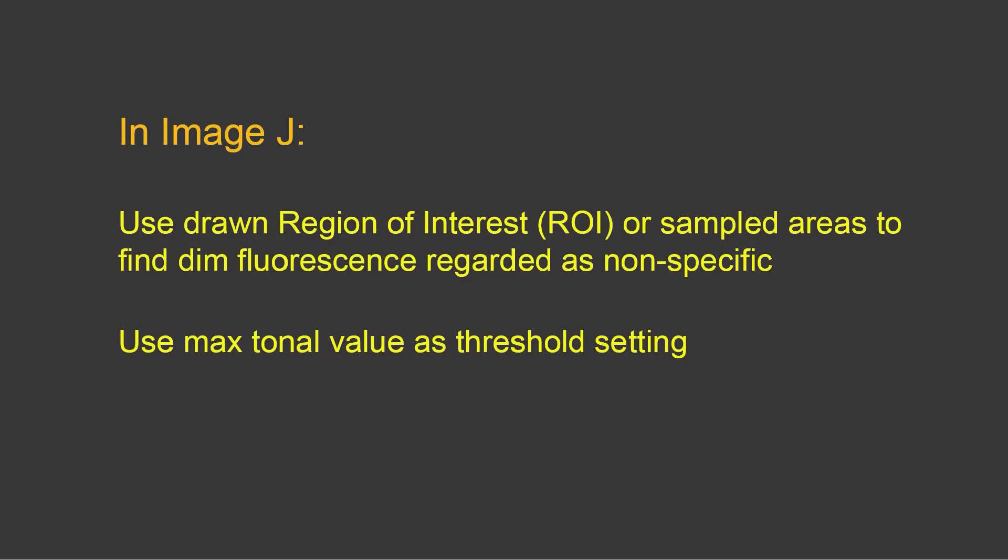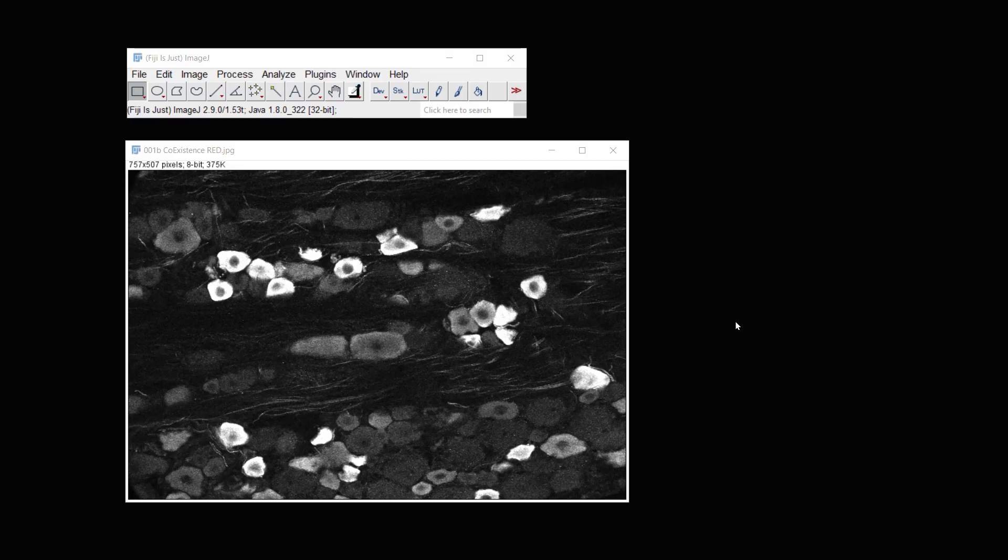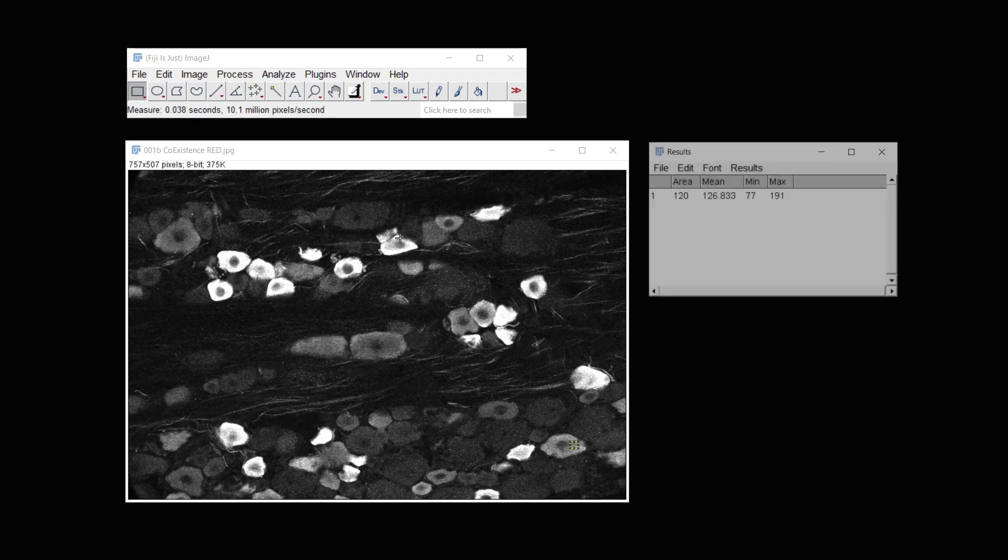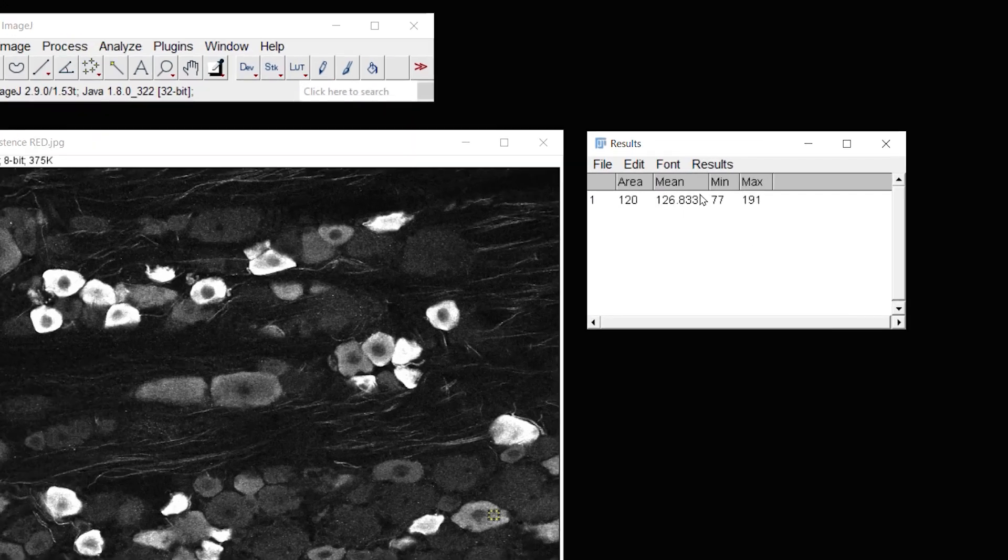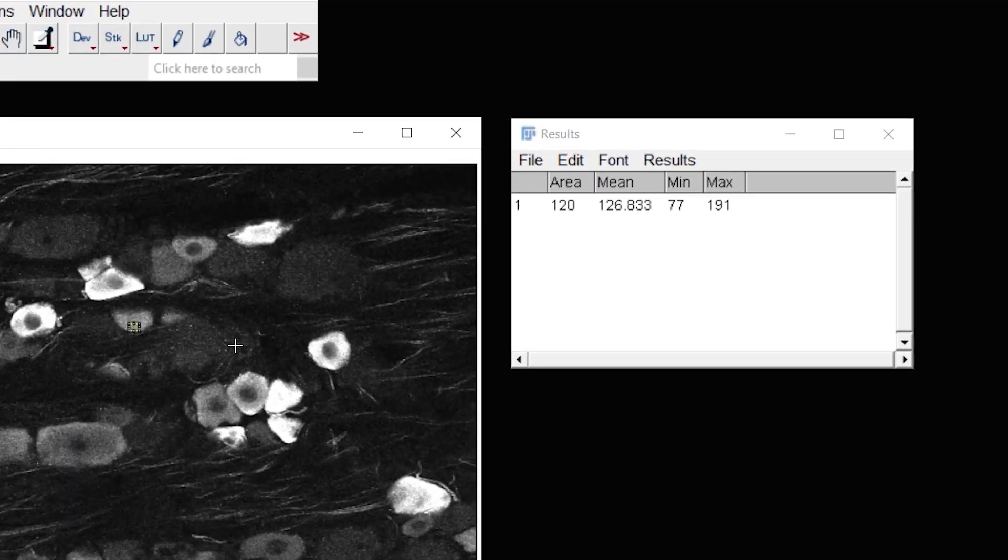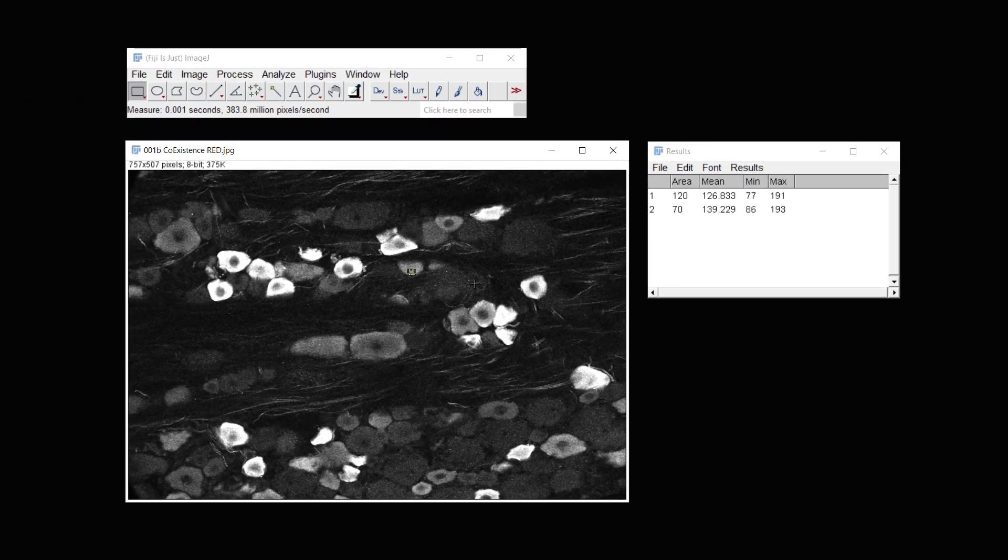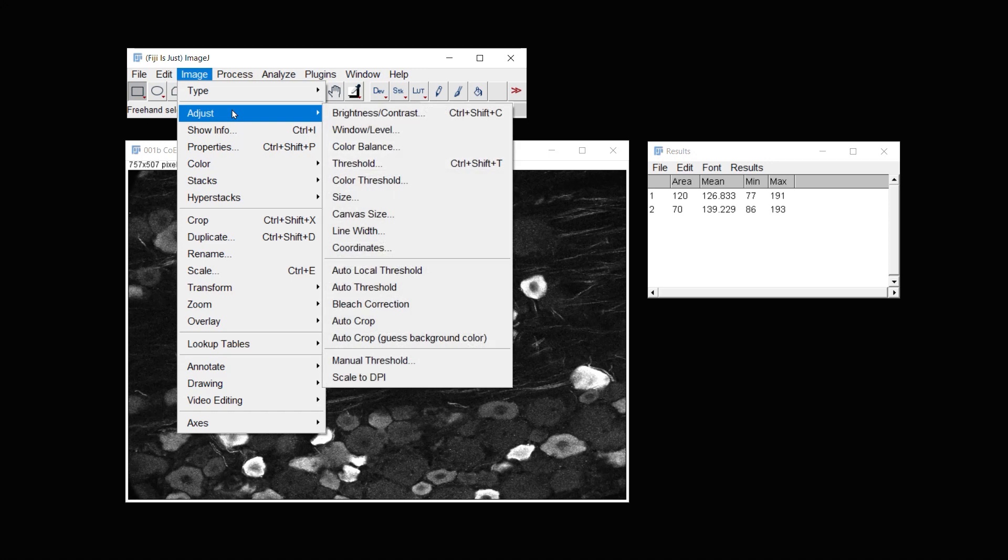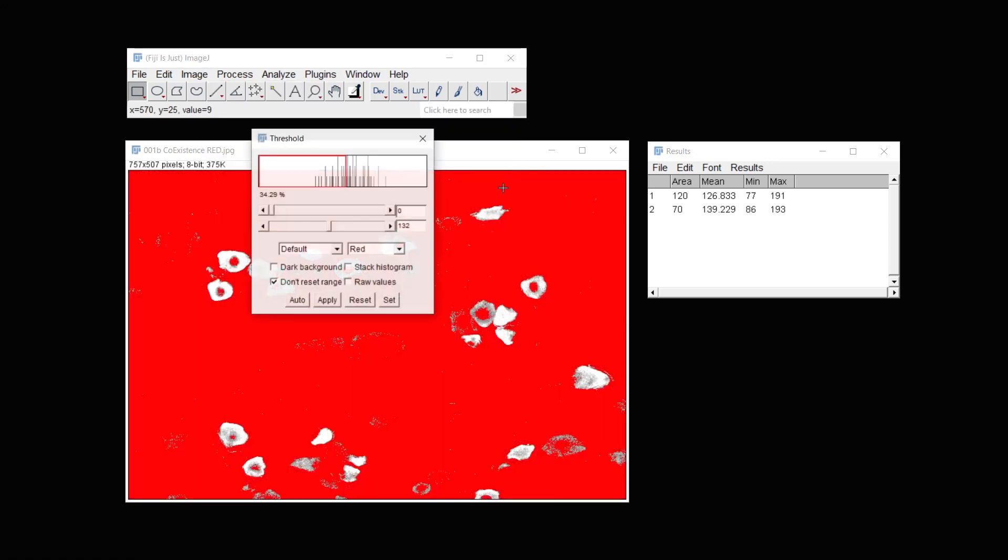In ImageJ, you use a drawn region of interest, and then sample that area to find the dim fluorescence regarded as nonspecific, and then again use the max tonal value as the threshold setting. If I am in ImageJ with the same image, I can use an icon here, the box icon, the rectangle icon, and I can actually outline areas that I would like to measure from. And then using CTRL-M, I can get a measurement and see what the mean is. And I can measure from several areas and do the same thing in order to determine what the greatest mean is. I'm just going to do two positions here, and this one shows 139. And so in this program, I could then set the threshold at 140.